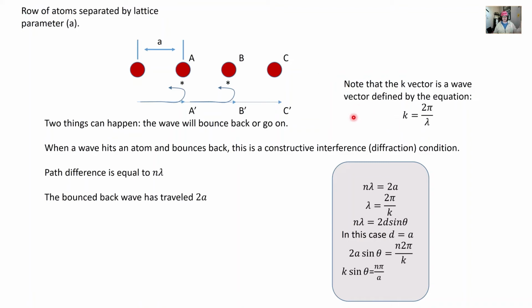And k in terms of a wave vector, and I know early on in this class we said k equals 1 over lambda. When we talk about it as a wave vector now, the wave has periodicity, okay? And so we add in this 2 pi, so k equals 2 pi over lambda in this description. So it's a little bit different than what we talked about before. I'm just putting it out there to show that there are different flavors of Bragg's law. That's what we're going to get to. And I already showed the punchline. I meant to animate it, but that's okay.